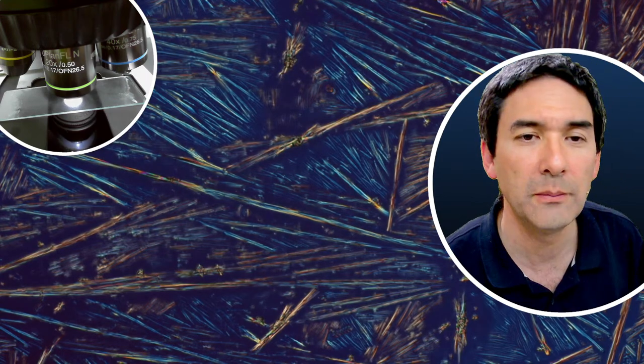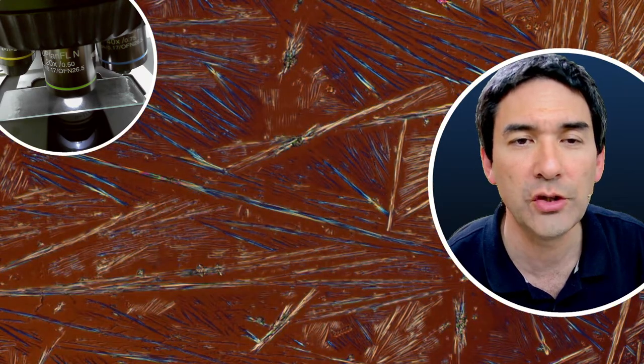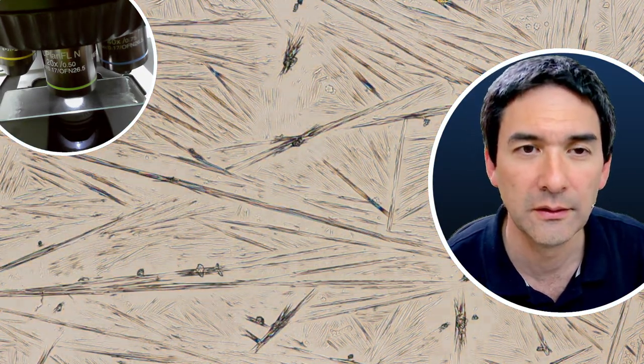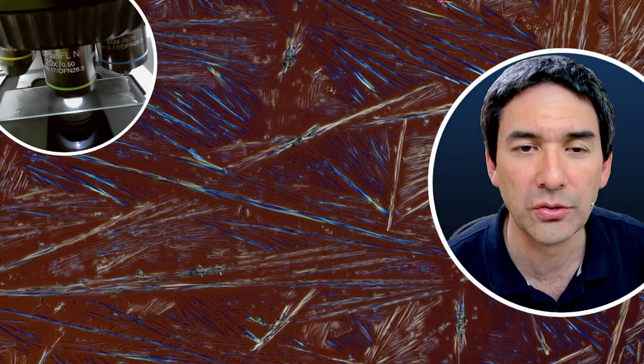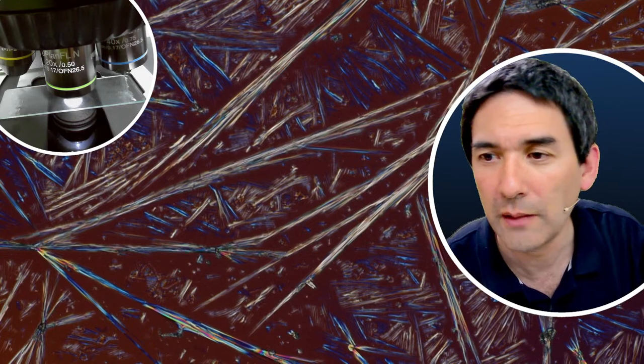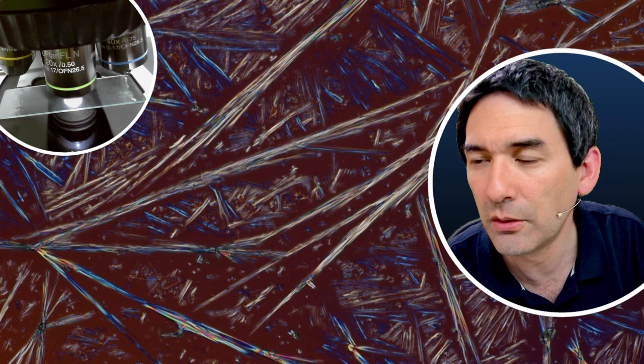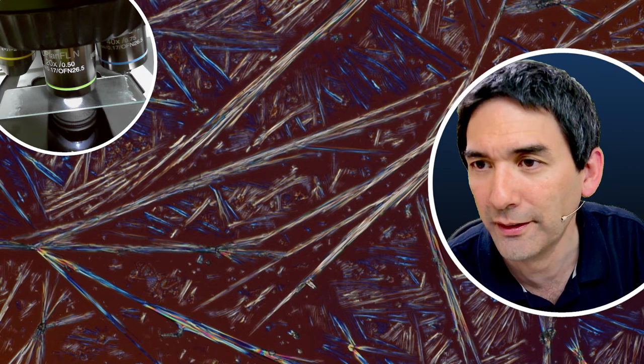Let's go up a little bit, and if I play around with the prism, then I'm able to change the background also a little bit. But I'm not able to get it completely black. Just wanted to illustrate a little bit of how it looks different. So I'm going to interrupt myself again, and then we're going to try this again because it was so fun.